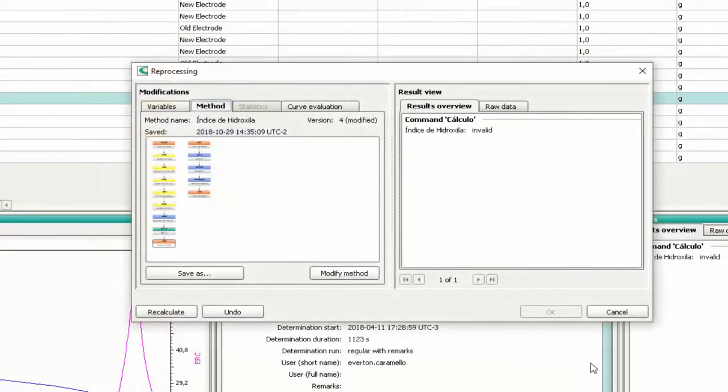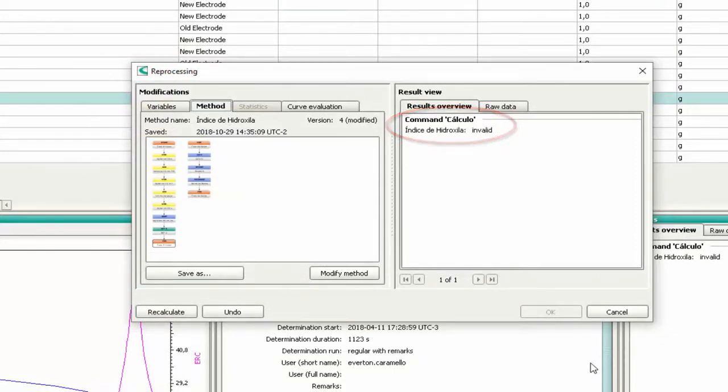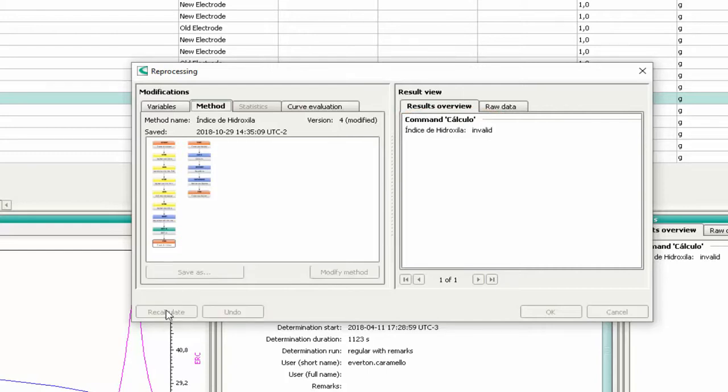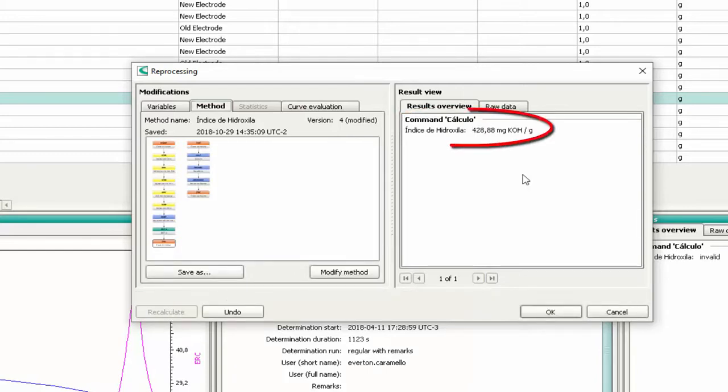You can see that before the recalculation, the result is invalid. Press the button Recalculate. Now you can see that the result is valid.